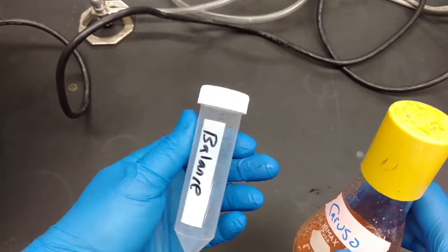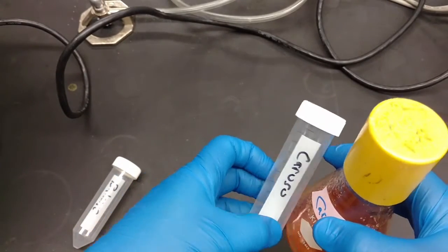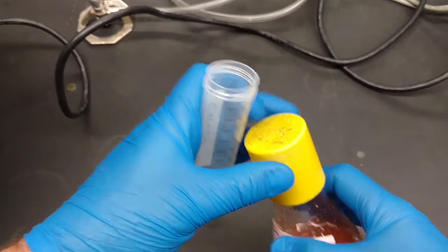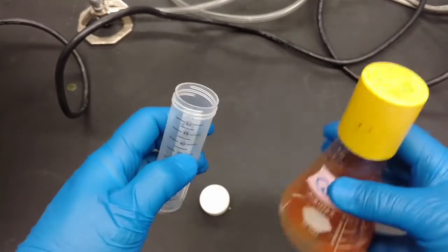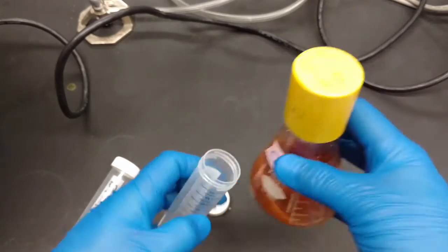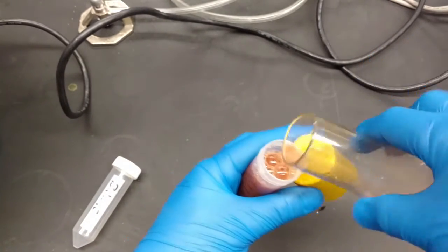You're going to need a 50 mil conical tube — this one is the balance so we don't want to use that one, this one is the one we're going to use. Take off the lid, take your flask, give it a swirl to get all the solids floating. The better you do with this, the easier it's going to be to clean.